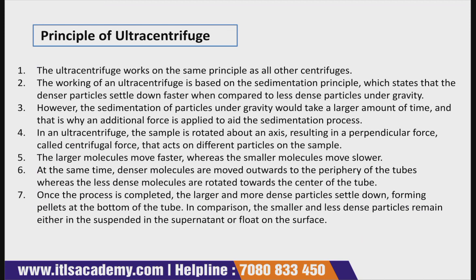Now comes the very important part of this topic: what is the principle of ultracentrifugation. If you see the principle of ultracentrifugation, the basis of ultracentrifugation is the same as normal centrifugation. Means how?